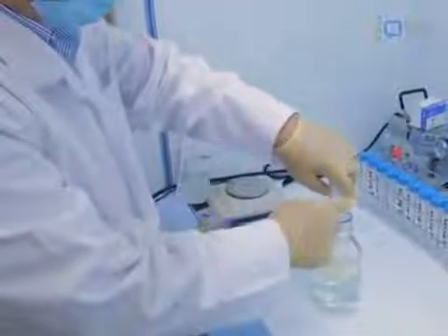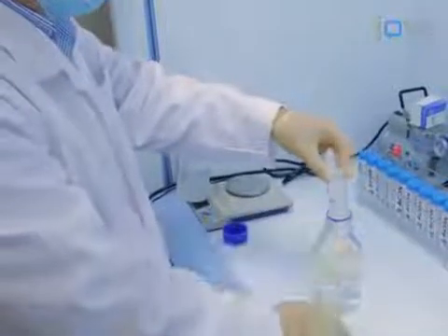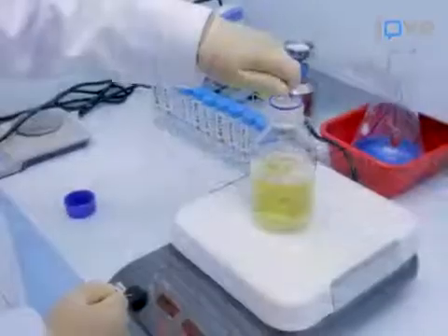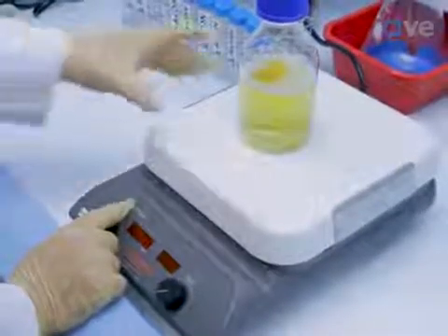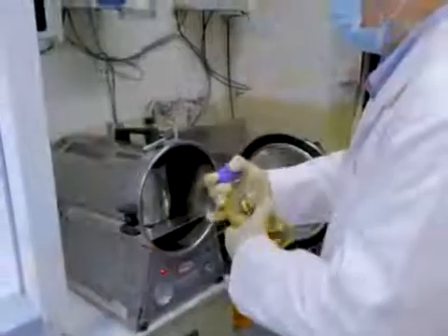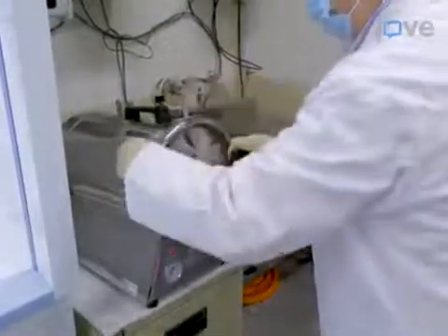Weigh out 8 grams of LB Lenox broth powder and place it into a 500ml laboratory bottle with 400ml of water. Add a magnetic Teflon stirring bar and stir the contents for 20 minutes. Cap the broth tightly and autoclave the contents at 120 degrees Celsius for 10 minutes.